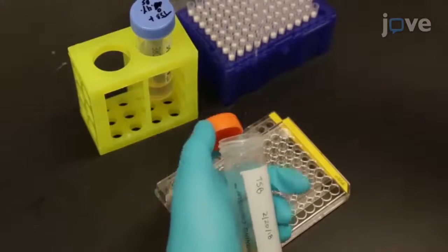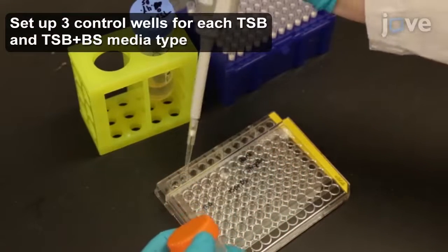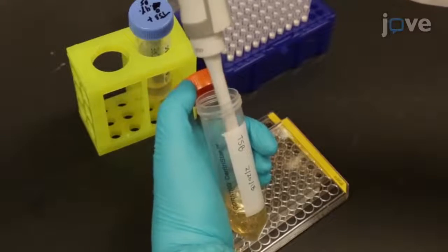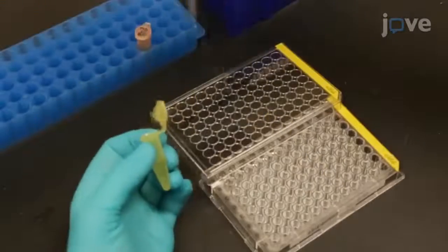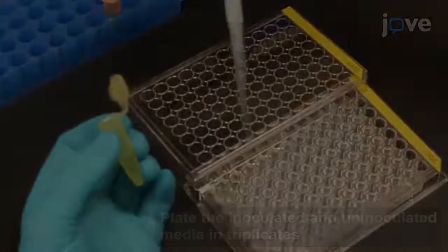Then, add 130 microliters of uninoculated control media to each of 3 wells in a sterile, clear, flat-bottomed, tissue culture-treated 96-well plate. This will be the blank control. Add 130 microliters of inoculated culture into each of the 3 wells.